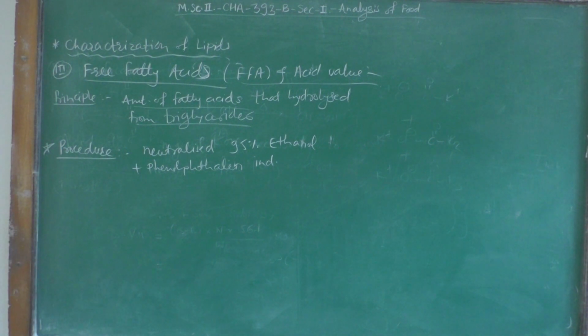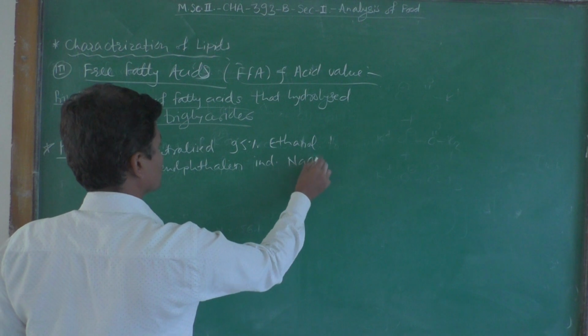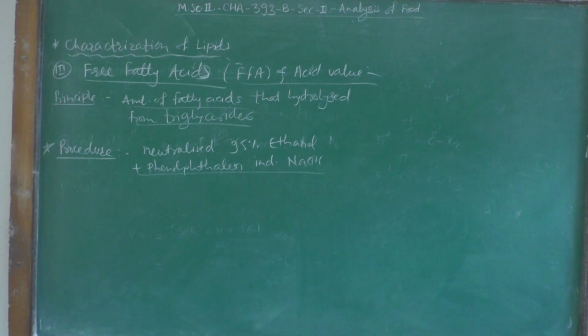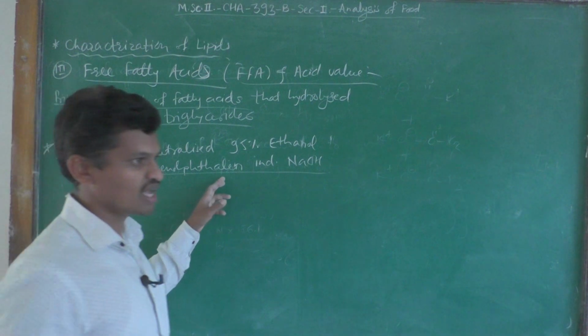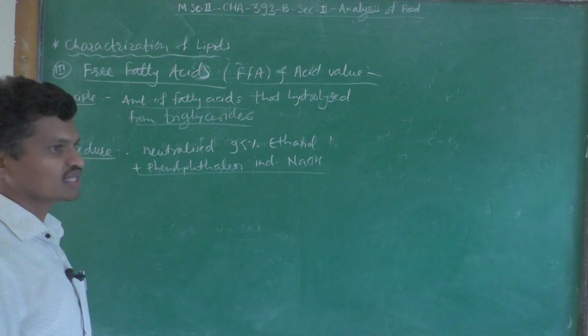Sorry, NaOH is used. All these are titrated with this. So phenolphthalein acts as an indicator, NaOH is the base, and the neutralized ethanol is the solvent.